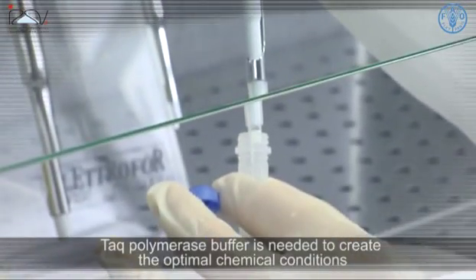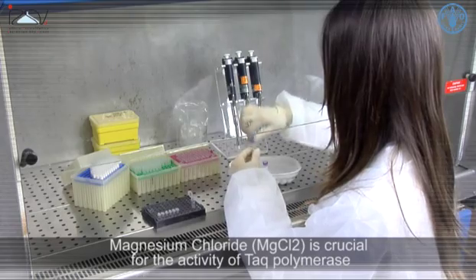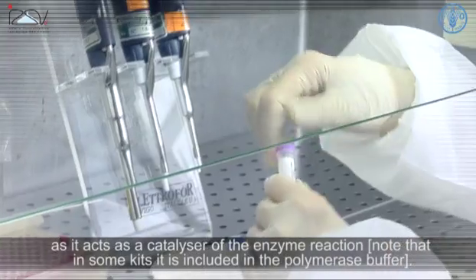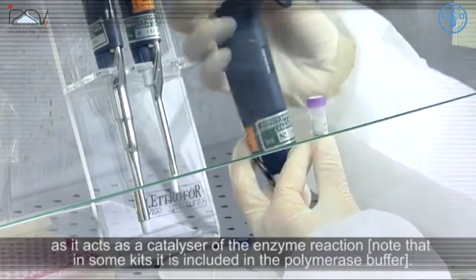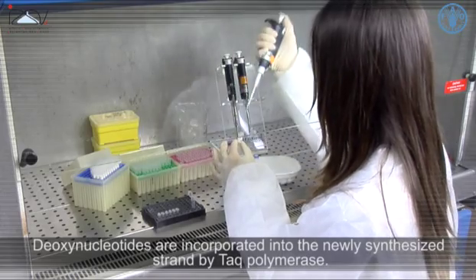Taq polymerase buffer is needed to create the optimal chemical conditions for the activity of Taq polymerase. Magnesium chloride (MgCl2) is crucial for the activity of Taq polymerase as it acts as a catalyser of the enzyme reaction. Note that in some kits it is included in the polymerase buffer. Deoxynucleotides are incorporated into the newly synthesized strand by Taq polymerase.